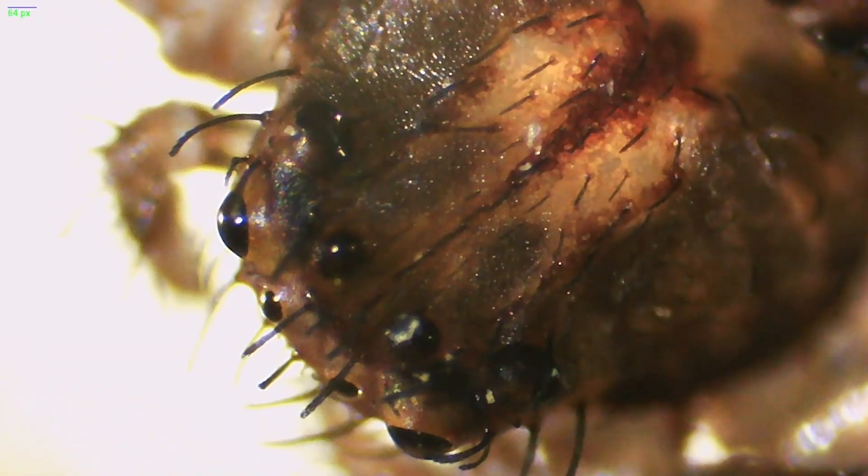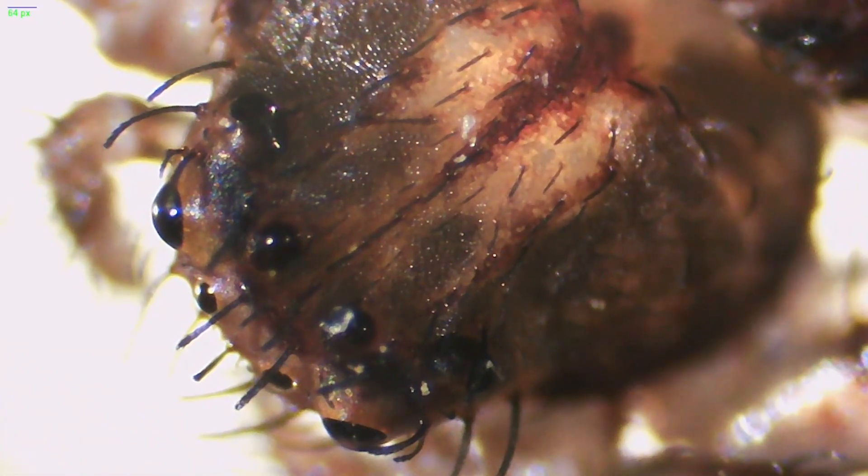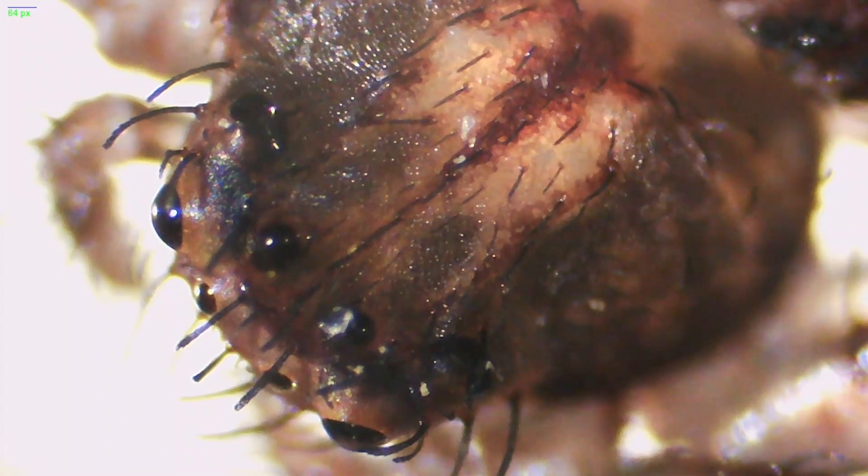Anyway, I want to flip this guy over and let's take a good look at his underside. But before we do that, let's see if we can see a heartbeat on the back. I'm going to adjust the light and see if we can see it. Alright, so we're at the back end here and we can slightly see that heartbeat here, right here, there you go.